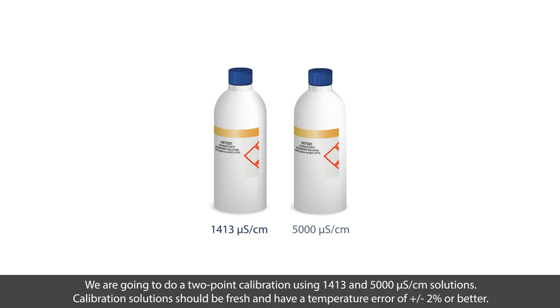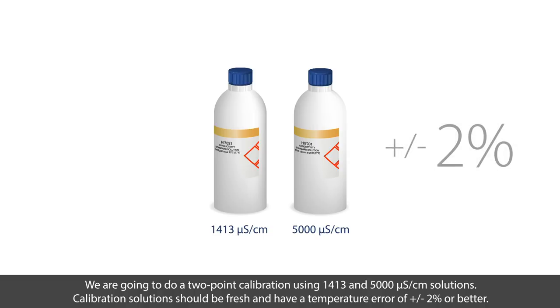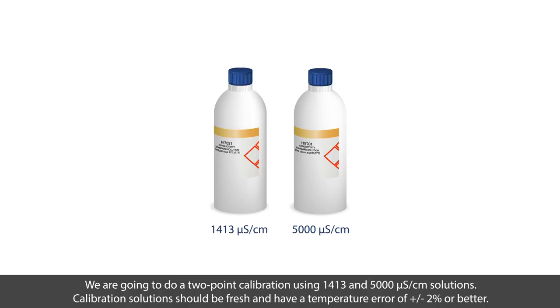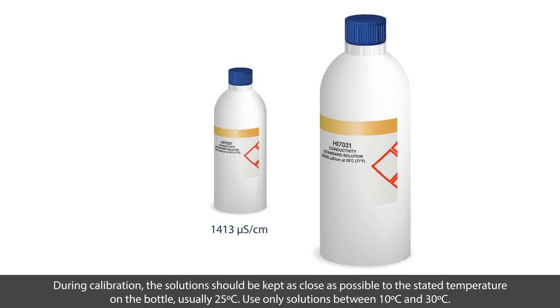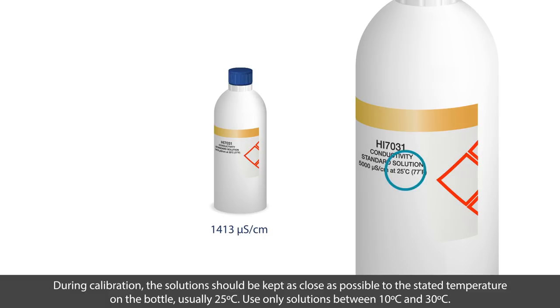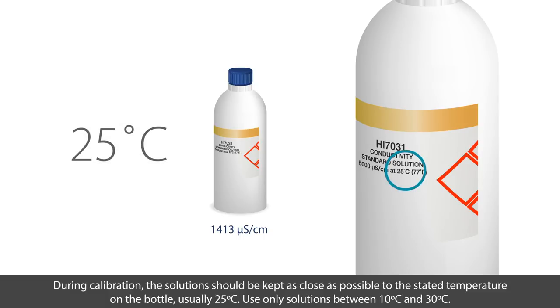We are going to do a two-point calibration using 1413 and 5000 microsiemens per centimeter solutions. Calibration solutions should be fresh and have a temperature error of plus or minus two percent or better. During calibration, the solution should be kept as close as possible to the stated temperature on the bottle, which is usually 25 degrees Celsius.